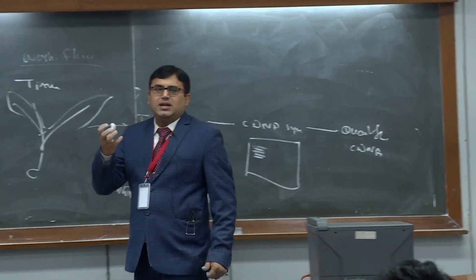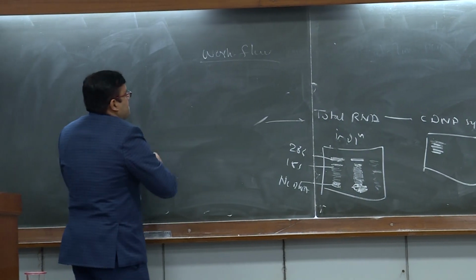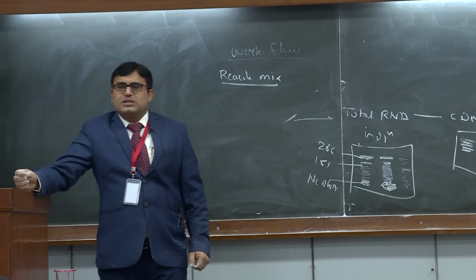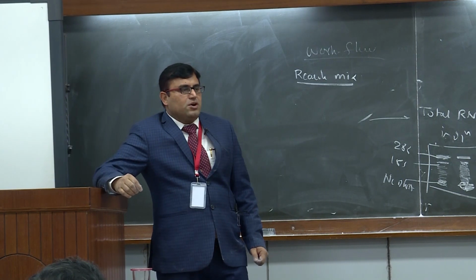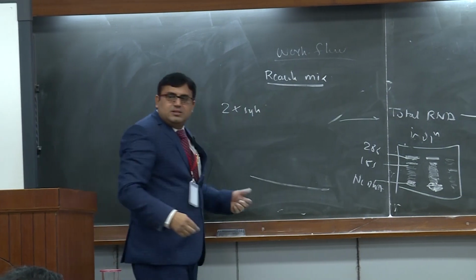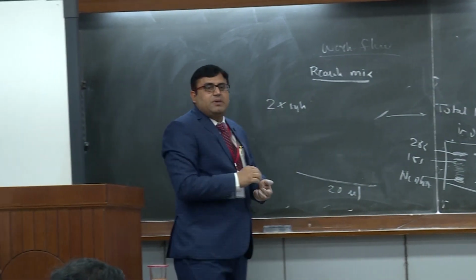So once you have a cDNA with you, next is the reaction mixture. So basically I'll tell you the protocol about SYBR, which is very commonly used. In case of SYBR, it comes in 2x form, right? So first, the volume of the reaction. The most preferred volume of reaction in case of expression analysis is 20 microliter.